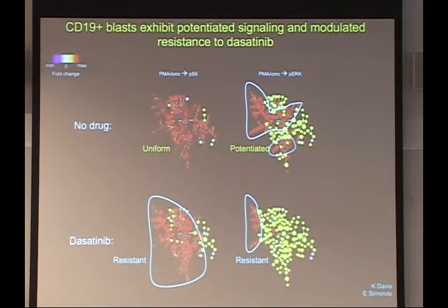I don't know what the end goal would be, but the point is that with the mass cytometry method, you have the ability to measure all of these things in one experiment. So you don't necessarily have to have a specific question at the get-go. You should have a question. You shouldn't just throw your samples at the machine, but it gives you fewer constraints. So it adds a little bit more discovery into something that was traditionally a very targeted approach.